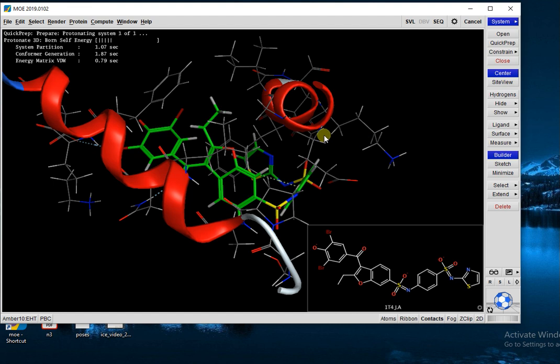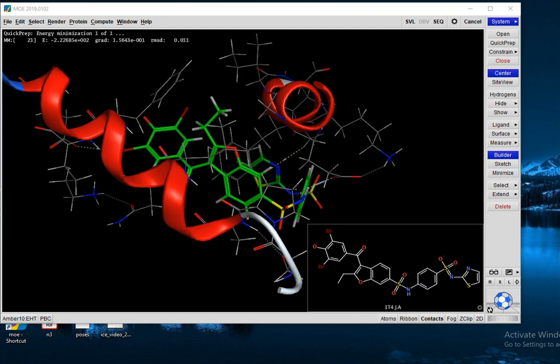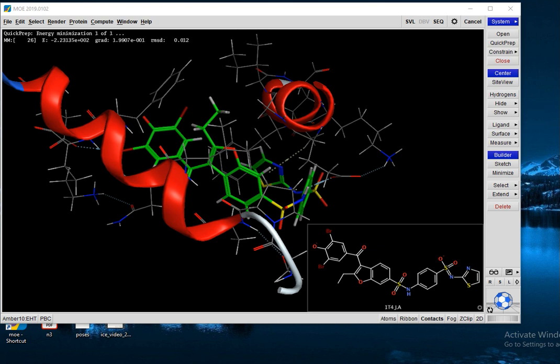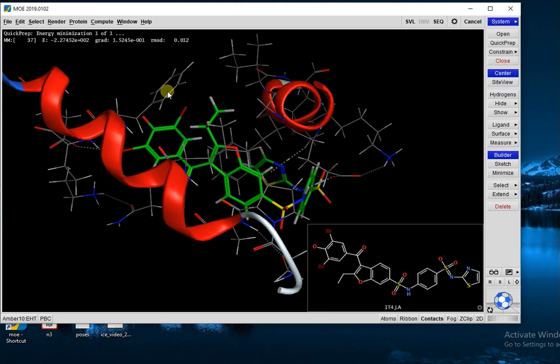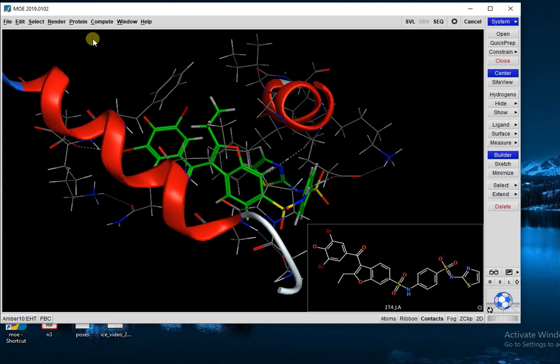It will take a few minutes or a few seconds, sometimes more time. You have to wait for this. When all of this will be done, the protein is prepared.